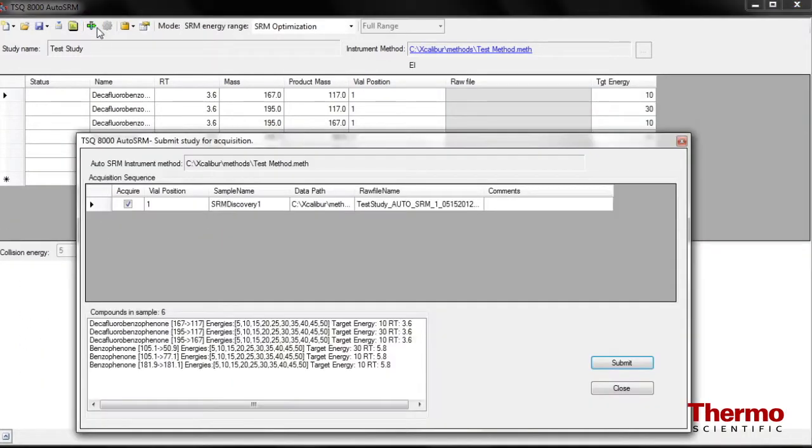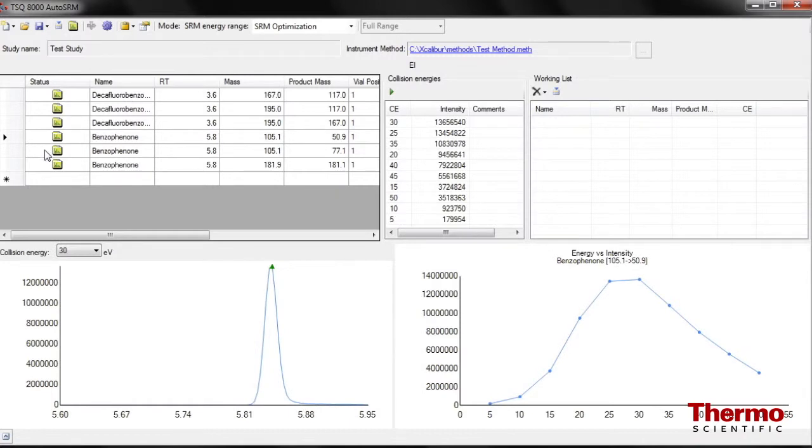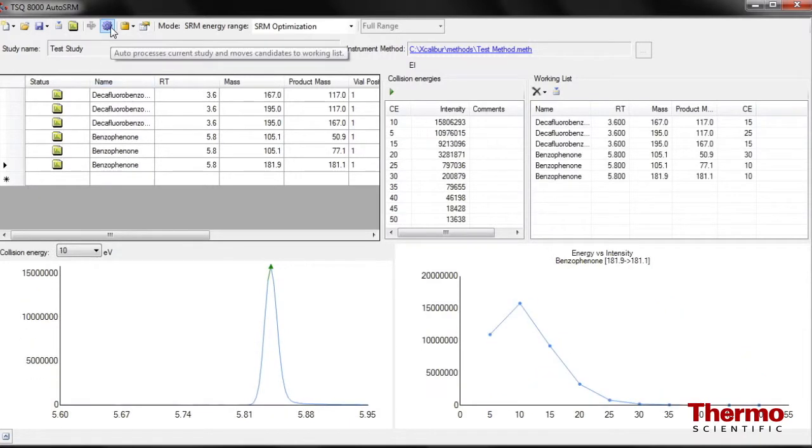Once your product ions are selected, AutoSRM can automatically optimize the collision energy for your chosen SRM transitions to within plus or minus one electron volt.